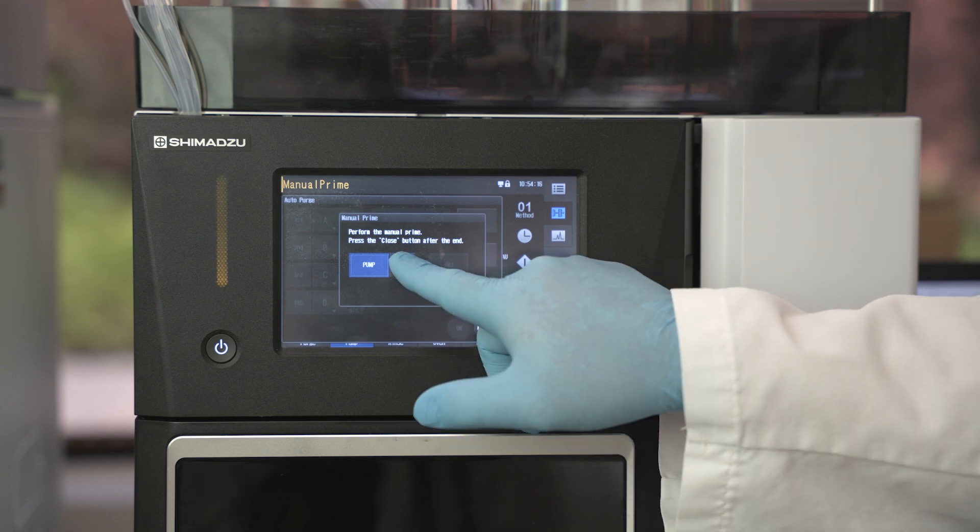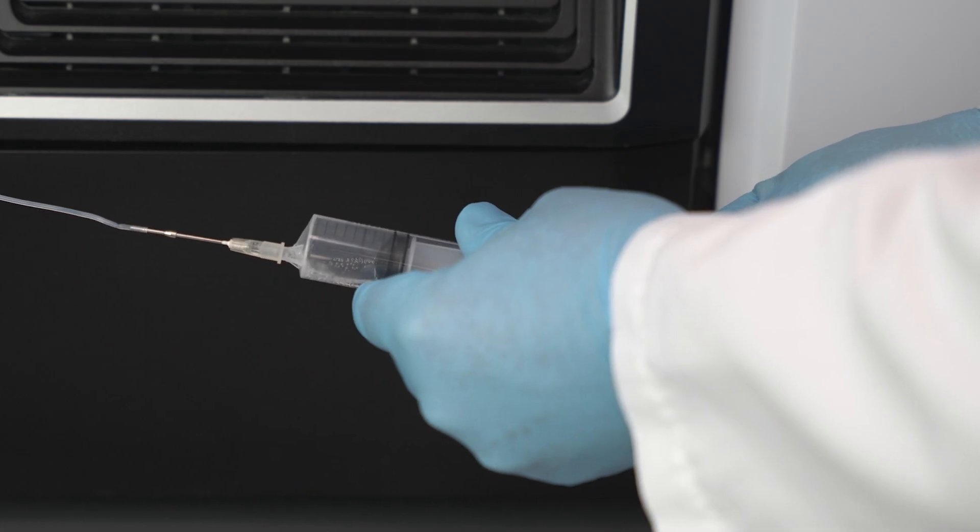Using the touchscreen, click on pump C. Collect 10 to 15 milliliters of mobile phase.